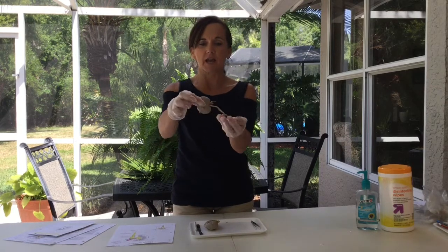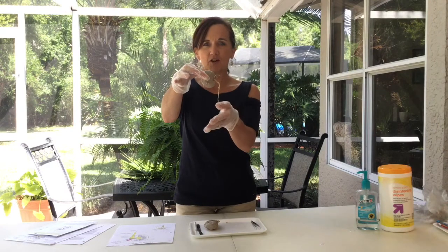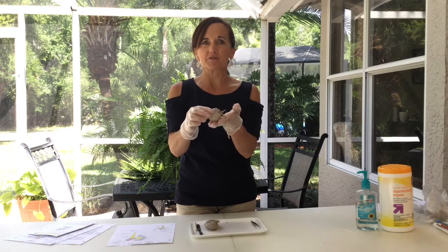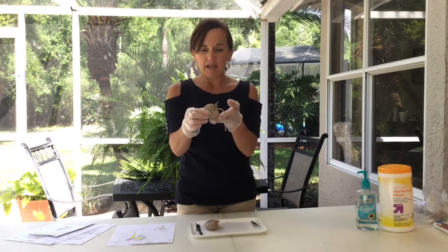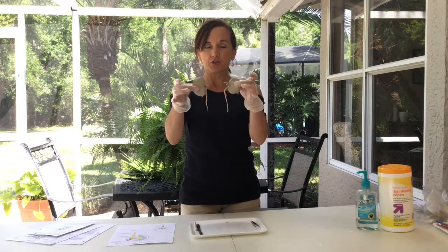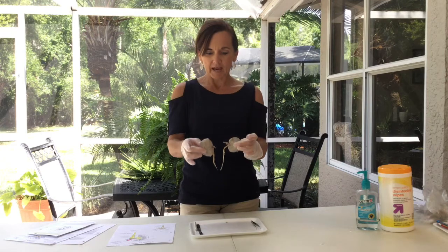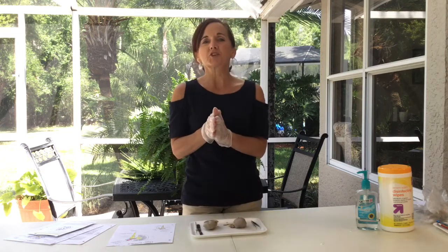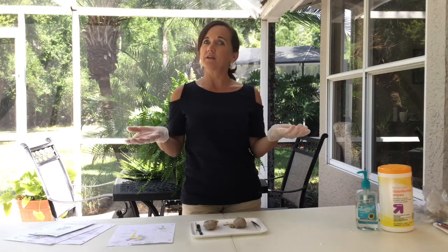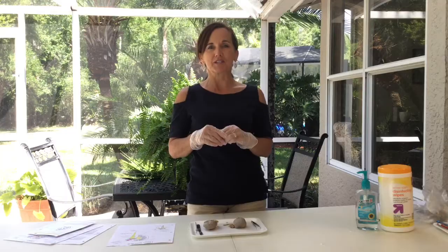Okay, so here is a kidney. We'll talk about the different things that you're seeing in just a moment. We like to use these because they're very similar to a human kidney, and you're probably aware, but maybe not, that we all have 2 kidneys. I have 2 today to show you. We're going to show how the blood circulates through the kidney, gets rid of waste, and then dumps all the waste out into your bladder. That might be where you've heard of kidneys before.